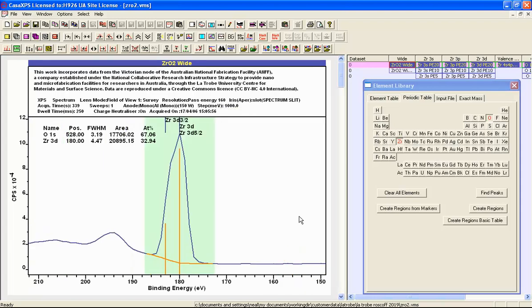This is an example of how the configuration files in CASA XPS can be used to modify the behavior in quantifying data.